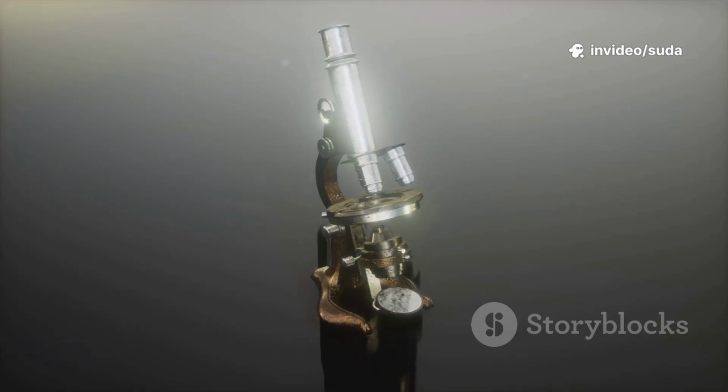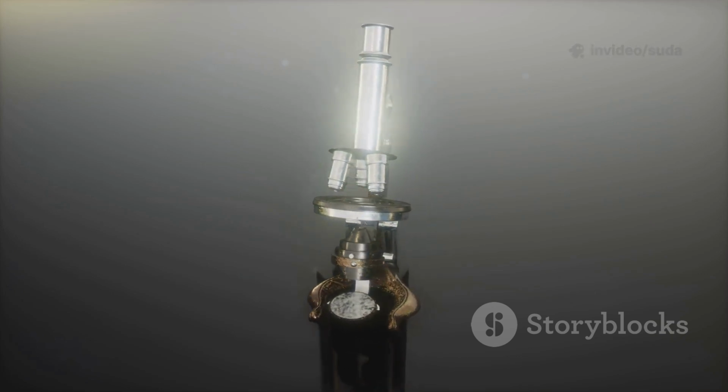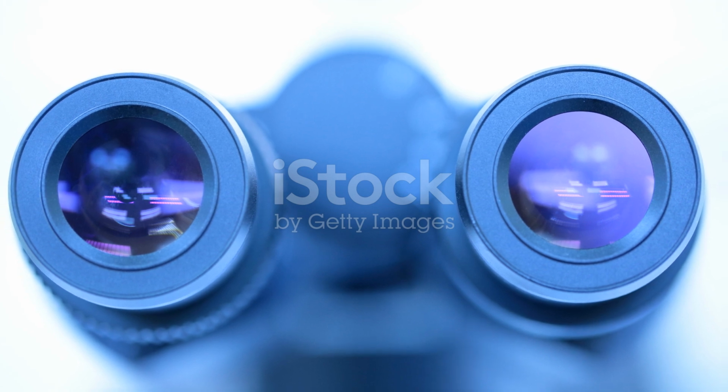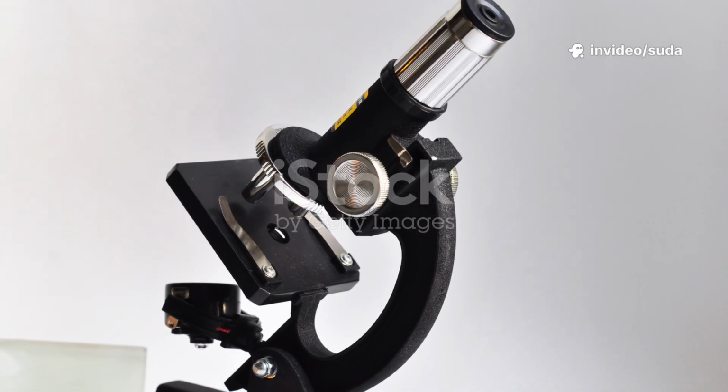Not all microscopes are the same. Think of them like vehicles. Some are simple, like a bicycle. Others are powerful and complex, like a rocket ship. There are three main types you should know about: simple, compound, and electron, side by side.